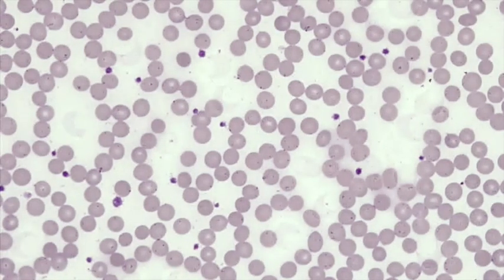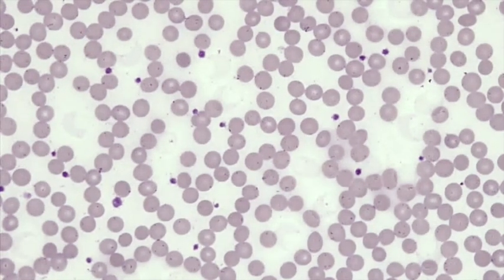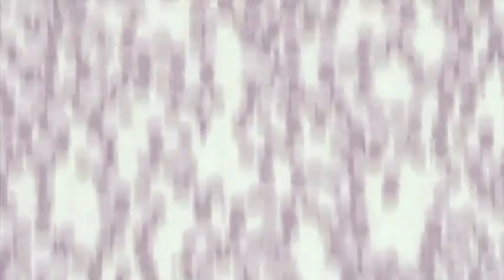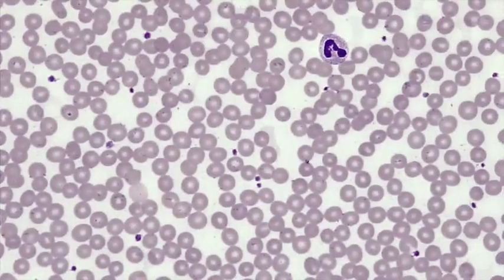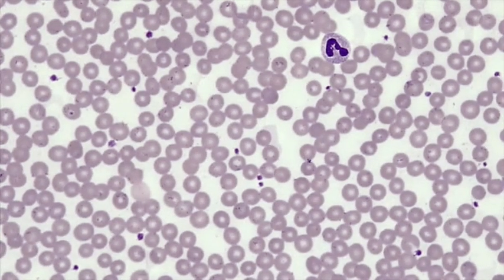Once the slide has been mounted and I have used the scan objective to locate the area that I want to start looking at, I can see the cells are pretty well spaced. Over here it's a little bit too thin, you can see a lot of white area. And on the other side of the area I had chosen it's going to be just a little too thick. You can see the cells are bunching together, some of them are overlapping, and this is not the optimal area to be doing a count.